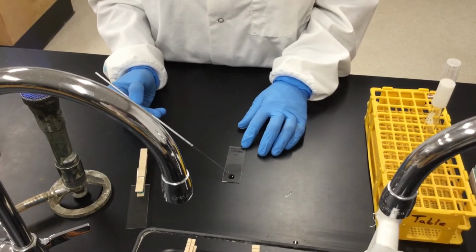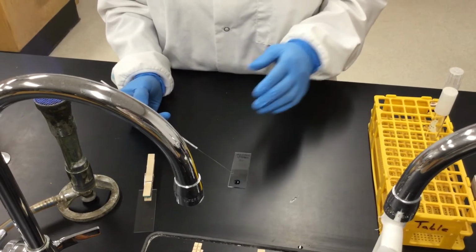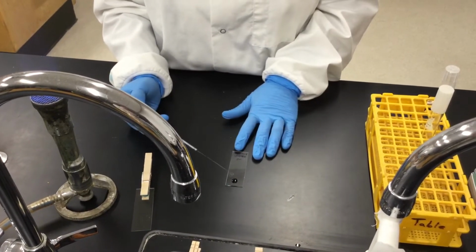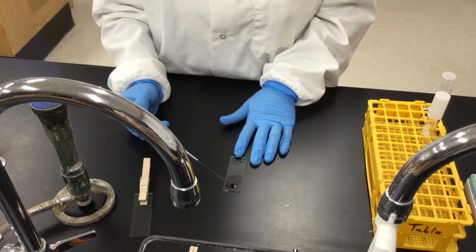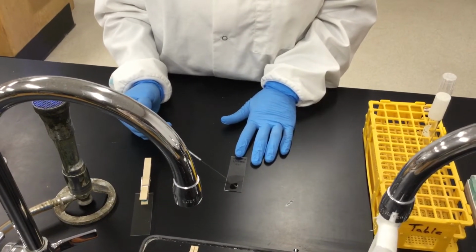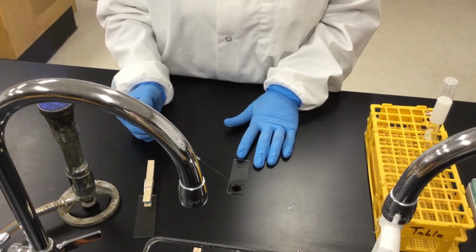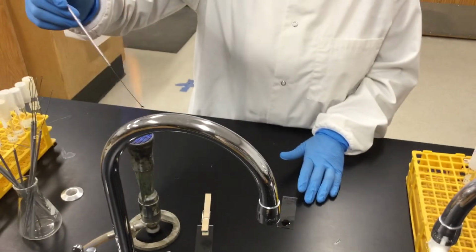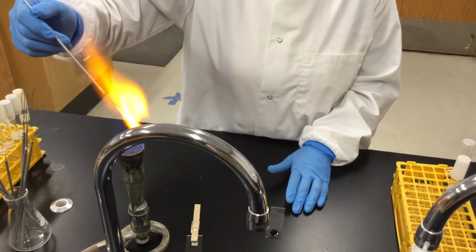And again, in negative stain, you have negative charges, so the stain or the dye does not penetrate the bacterial cells, so you stain the outside, and then you do this mixture in there, and then you will sterilize your loop.